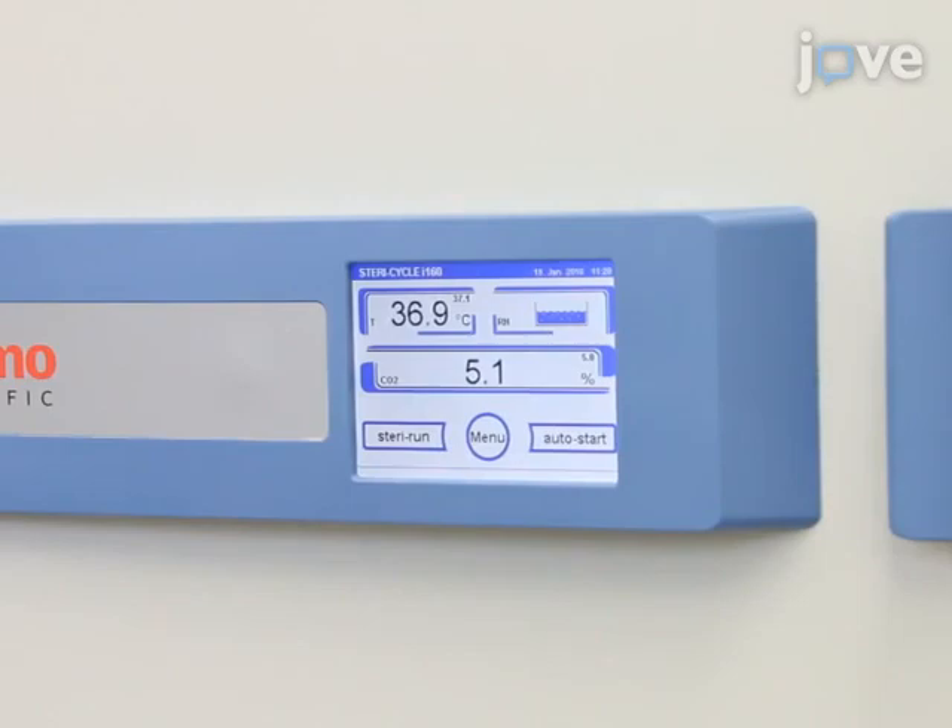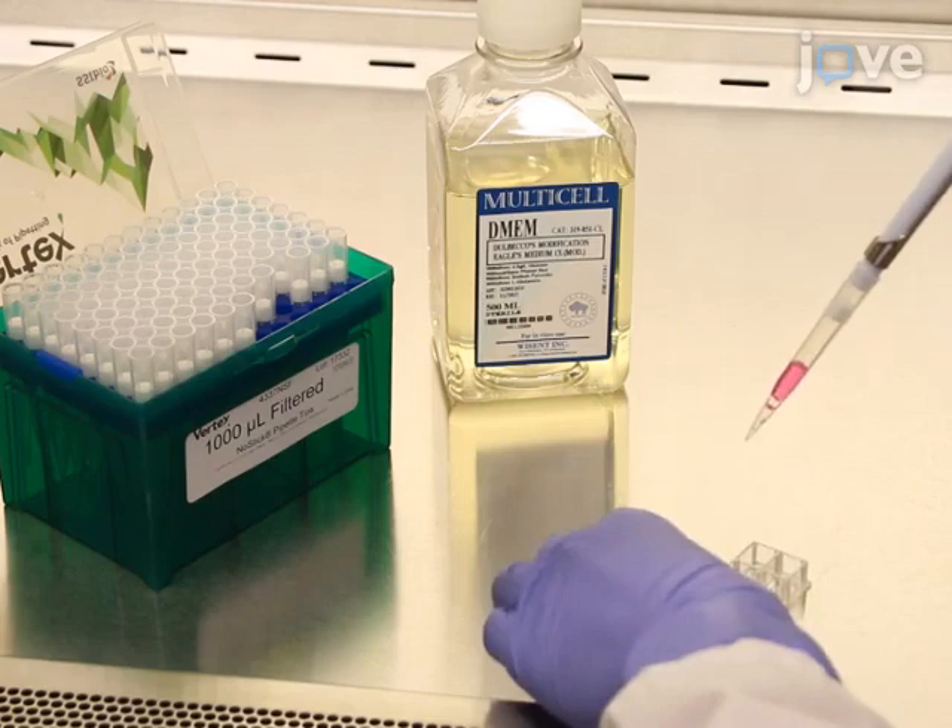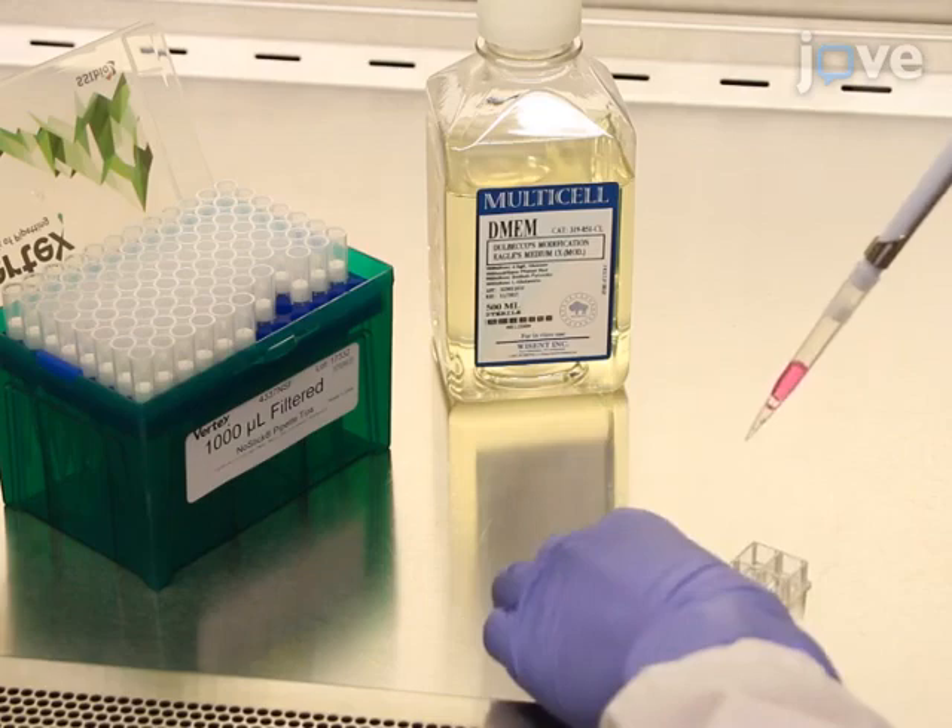Prior to micro-irradiation, use a micropipette to rinse the cells twice with medium without phenol red to ensure maximal exposure of the cells to the 405 nanometer laser.